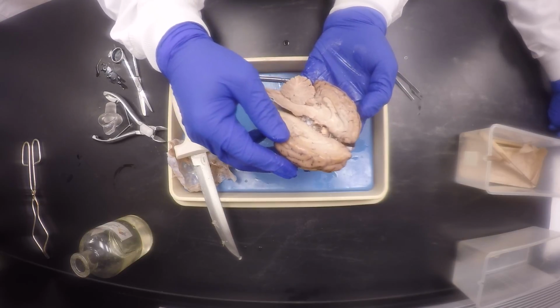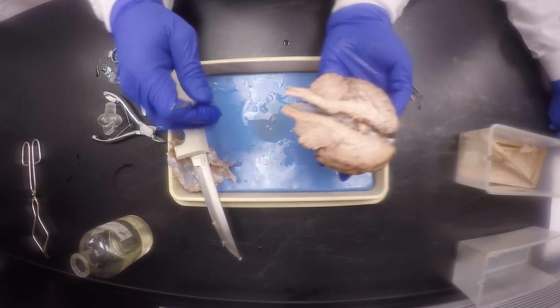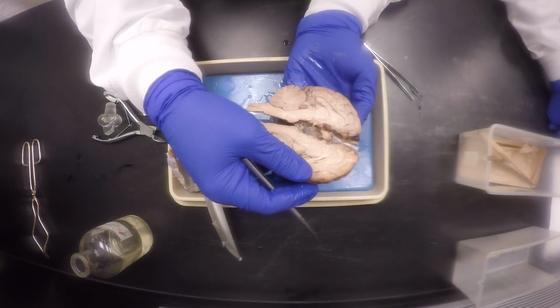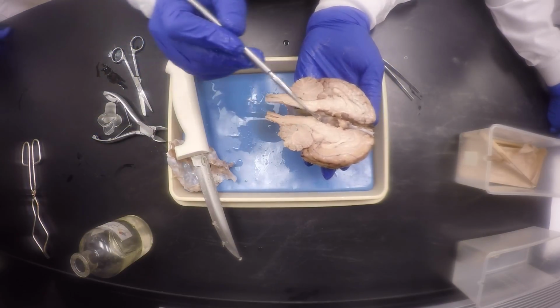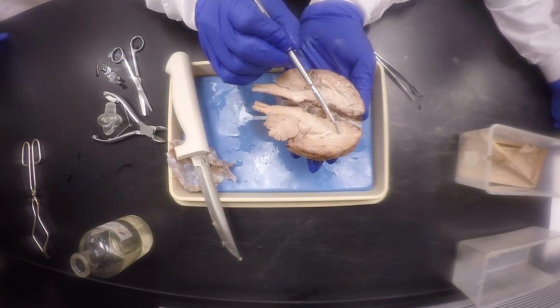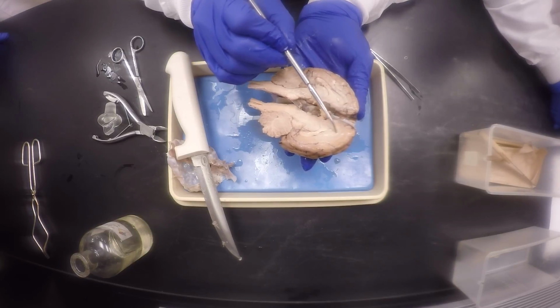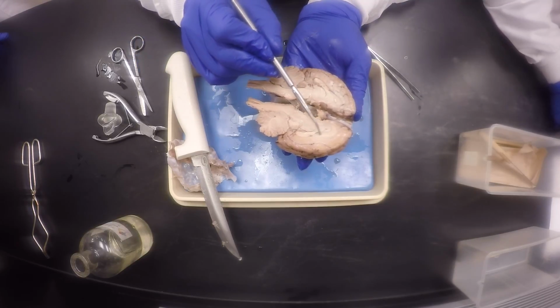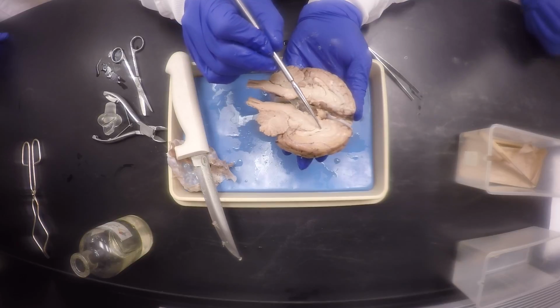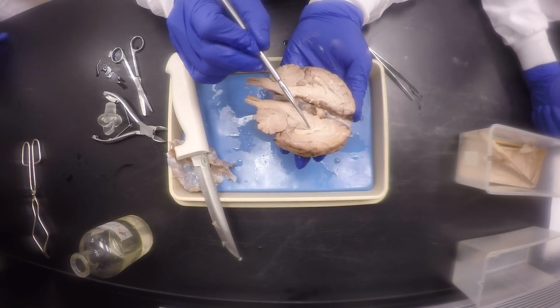Mine is kind of really badly done up. It's falling apart. So you guys with yours. Anyway, for now, let me show you the internal parts. Okay, so this white tissue right here is the corpus callosum, which is the same on that side. And this on the bottom is the fornix. Now this circular part here is the thalamus.